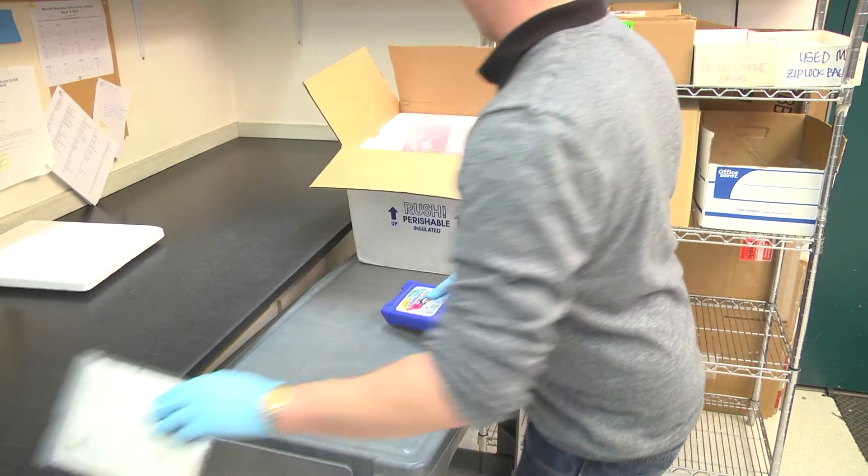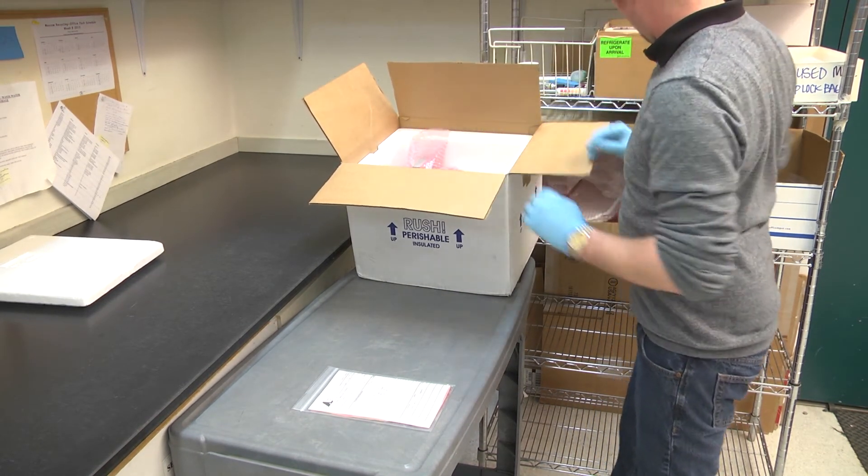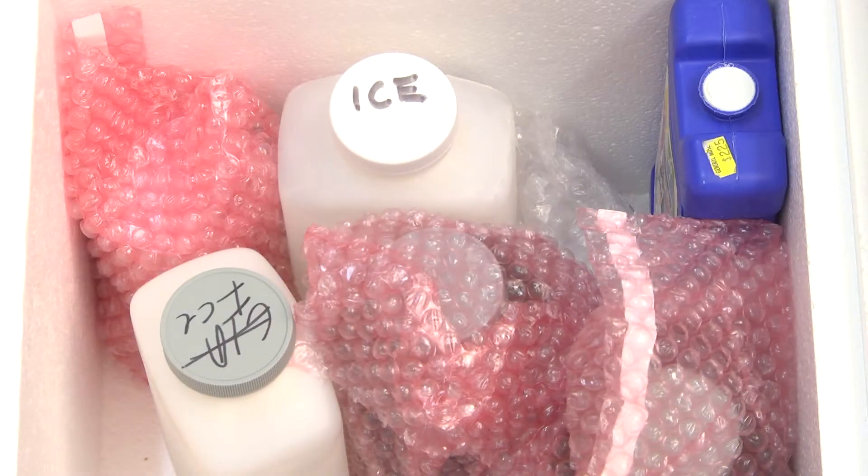Make sure that you have enough ice packs to ensure that the samples will maintain a refrigerated temperature throughout the shipping process. Do not use regular ice, which melts, creating both a mess and a risk of contamination. Pre-cooling samples prior to packing helps to maintain cooler temperatures longer.